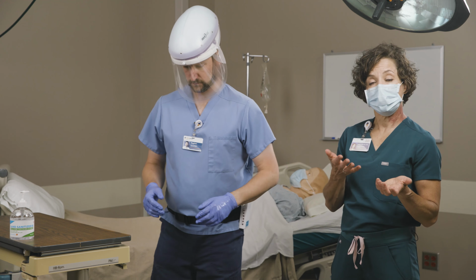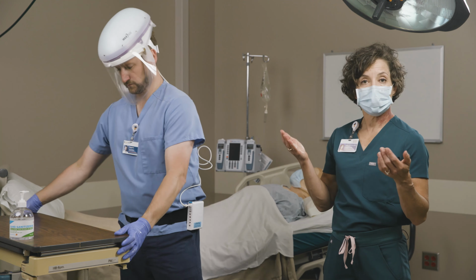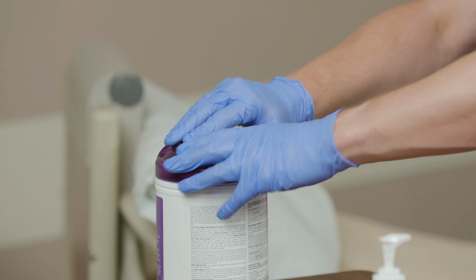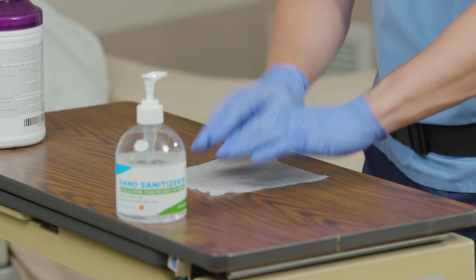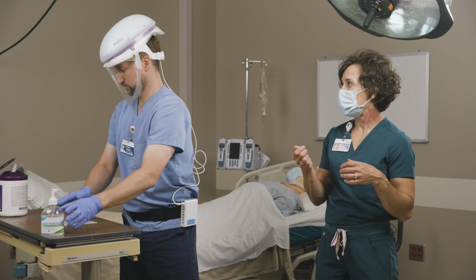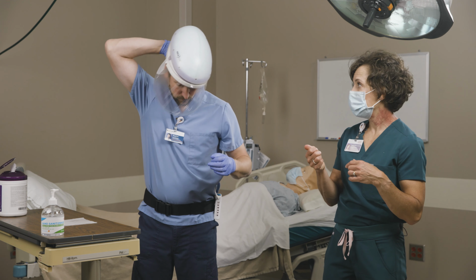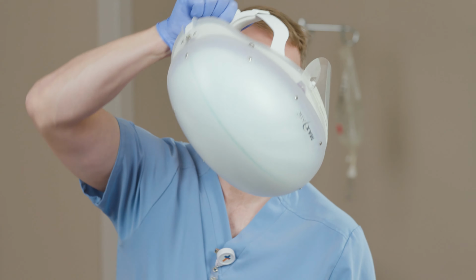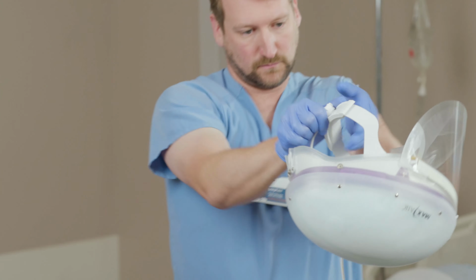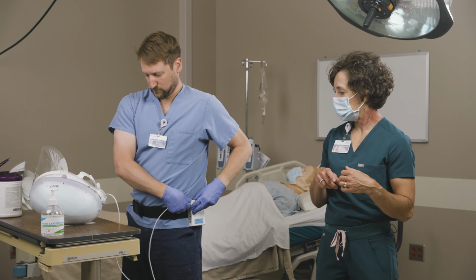Once he's out into the hallway, you want to have some sort of a surface to be able to doff your CAPR onto. So he's going to first take a disinfectant wipe out and set it out on the surface. And then he's going to remove his CAPR by loosening the knob on the back of his head, lifting it off, and setting it down on the surface to disinfect. I'm going to disconnect the battery from your battery pack.